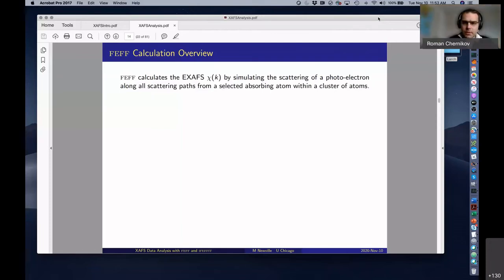Yeah. A couple more questions. One is about the cumulants: when does it make sense to include them in the fitting? Okay. I left that out partly in the interest of time. This is only a 4-hour workshop, not a 4-day workshop. What I find is that for most solids, most metal oxides, you don't need the third cumulant, or you don't have enough data to say. In the literature, I've said many times, we tried a third cumulant, it didn't make any difference. That's sort of a typical result, and might be the most common result.